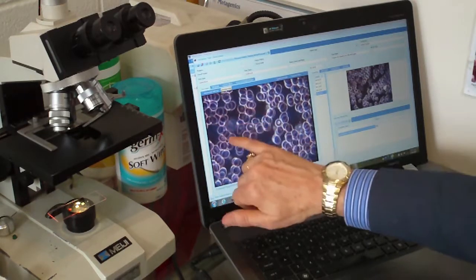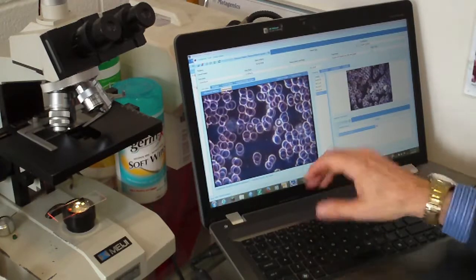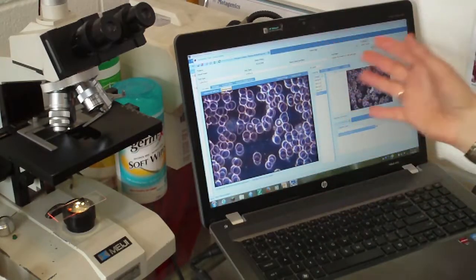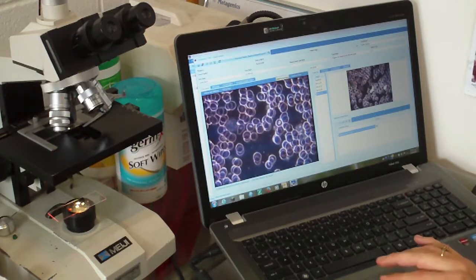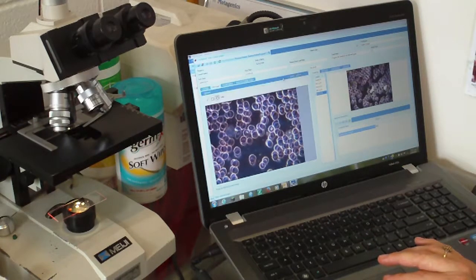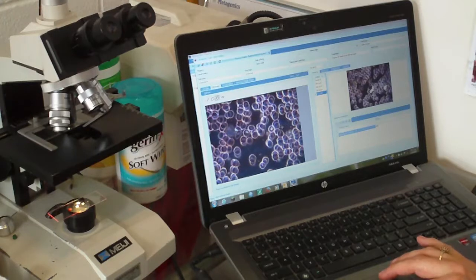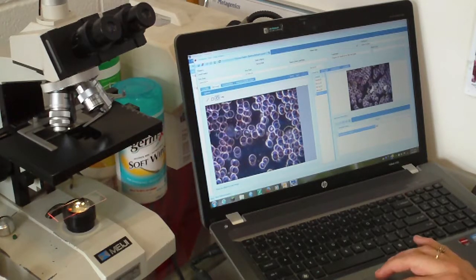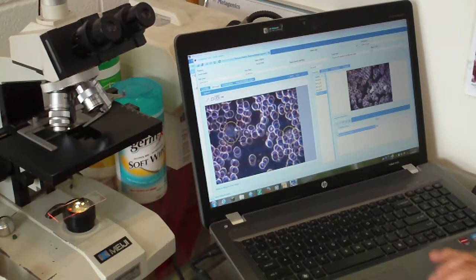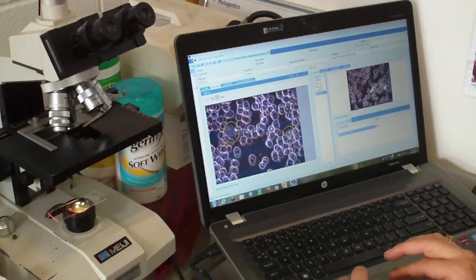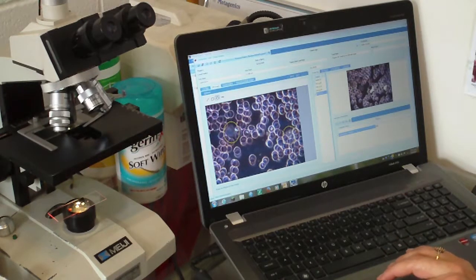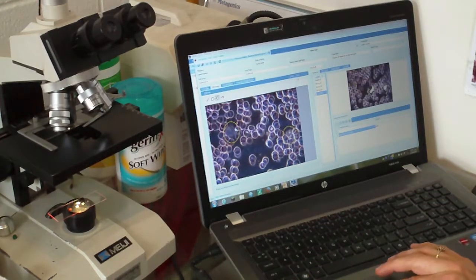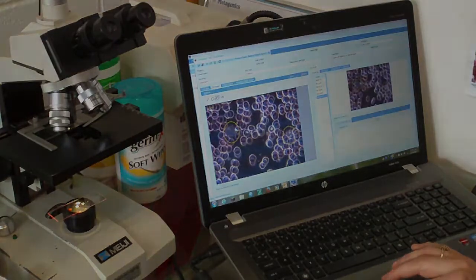And it hasn't picked up any viruses. Whereas this one's been cruising around the blood for probably 50 days plus, and it's picked up quite a few. So this would indicate to me that the patient has been experiencing a virus in the past. And that's true, they have. I know this patient well. They did with throwing off a bug from a family member quite successfully with some naturopathic treatments. And here's the proof, the new cells showing clear. No problem. So they throw off the virus quite nicely.